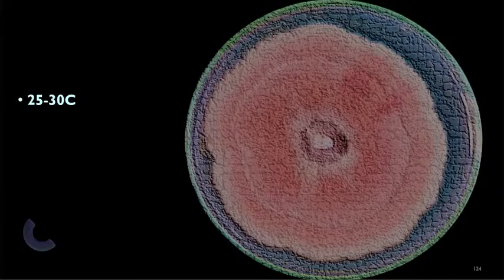You will not believe it, but in the laboratory that I'm working in, we have an incubator that is left at room temperature. You will not believe it. In the Philippines, we would just leave it inside the biosafety cabinet. But here we have our own incubator for this one. When I first arrived in the Middle East, I said, RT incubator. What's RT incubator? Room temperature incubator. We actually have that.